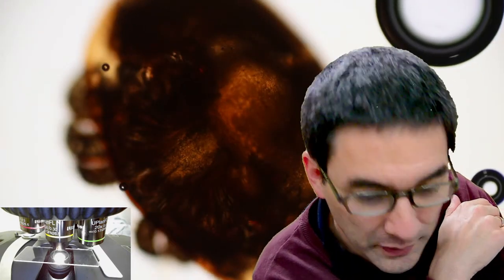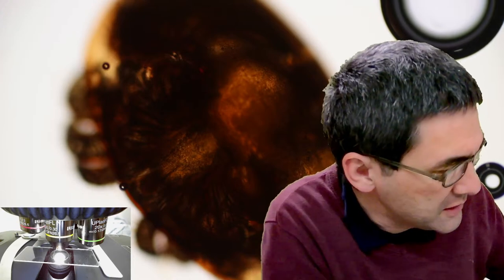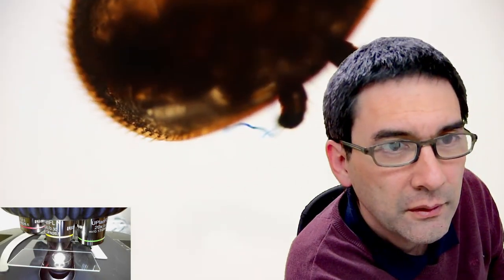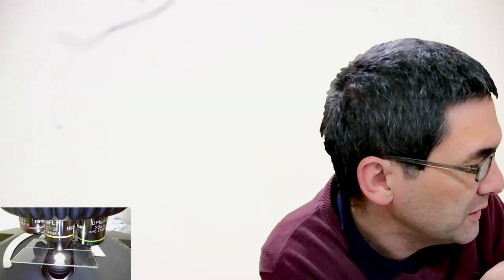Yep. And you know what? Next week, I'm really going to show this to you again. Maybe it has cleared a little bit. So that's the first one again. I've done this already a few months ago, and then I discovered after a day or two days, they became much more transparent.